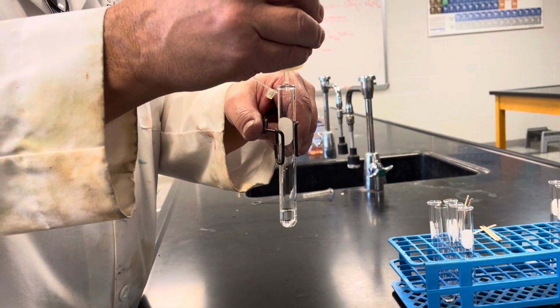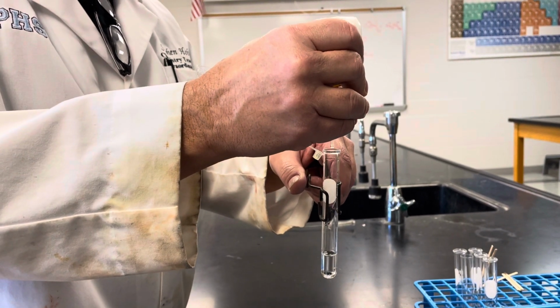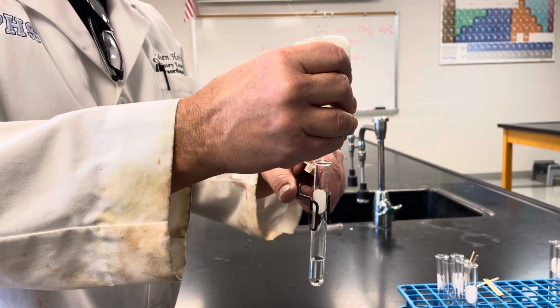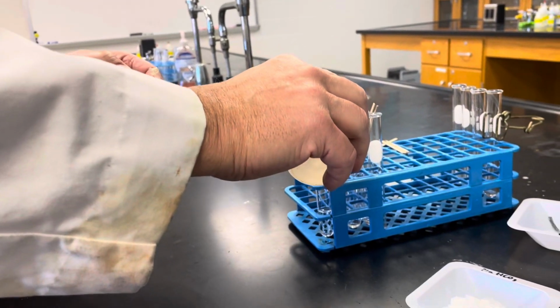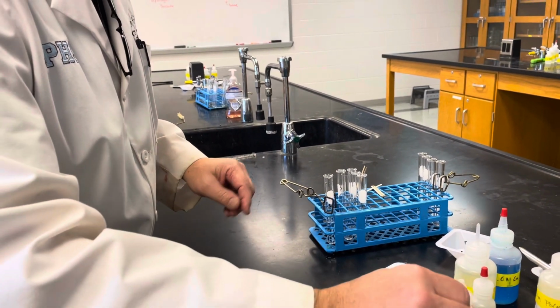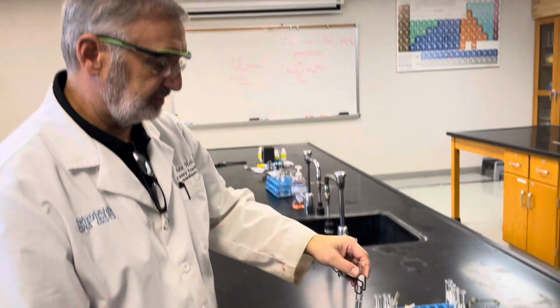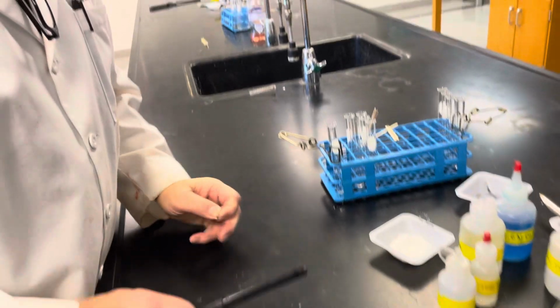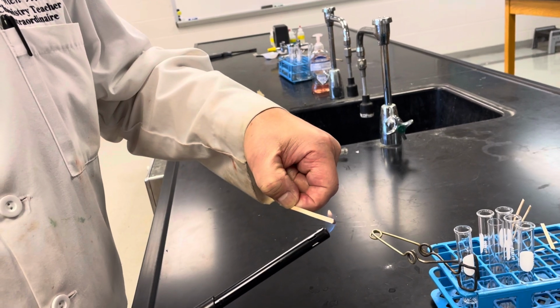The squirt bottle tip needs to be cleaned. And I'm just going to speed the whole thing up here. I'm just going to put a little bit more in this way. So now I have a test tube with about a fourth or a third of H2SO4. Then it says to take a small piece of magnesium, and I want to have a wooden splint ready to go and burning. So I have this wooden splint.